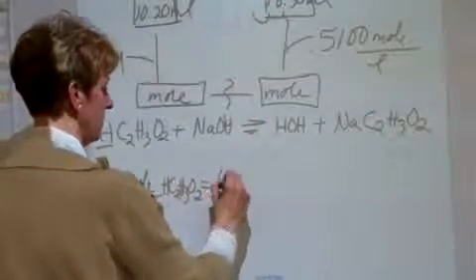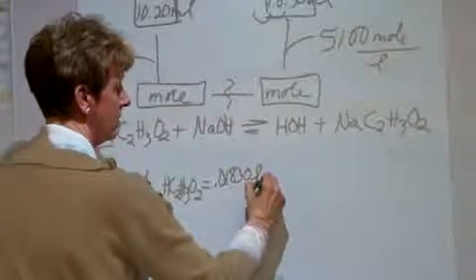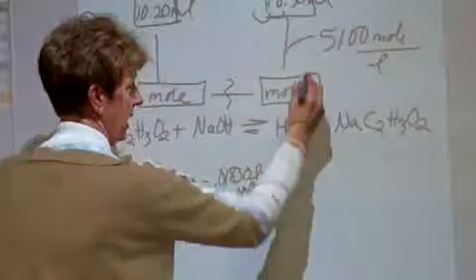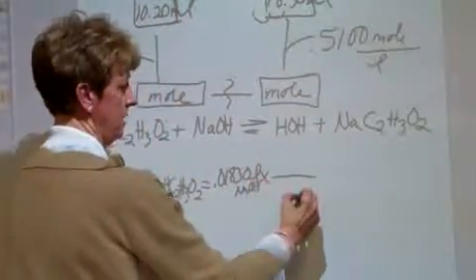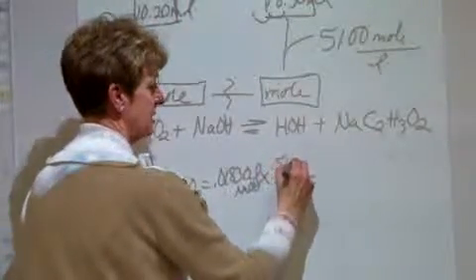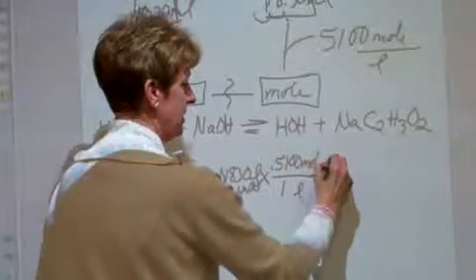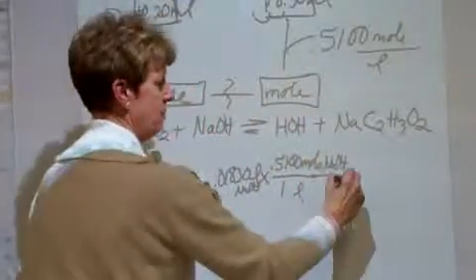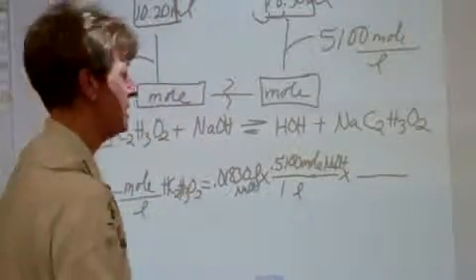Given, let's get this into liters right away. And so it's 0.018. Keep all your digits. They were measured. Liters of our base again. This was NaOH. Times our molarity conversion factor. Liters were in our given, so liters go in the bottom. The 0.51 sticks with the mole statement. Per 1 liter, this is NaOH. We're to moles. Let's cross the border right away.